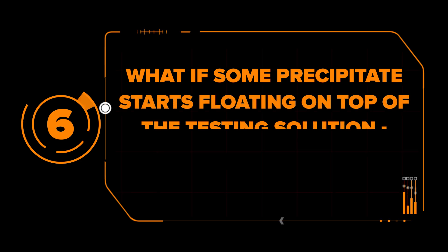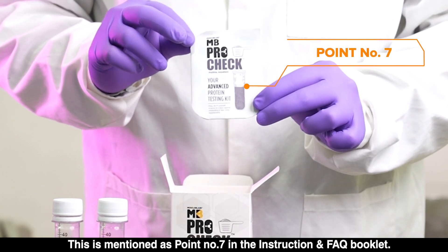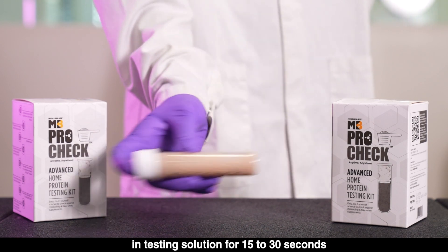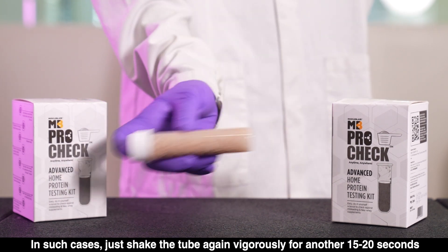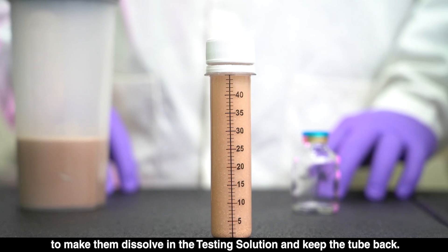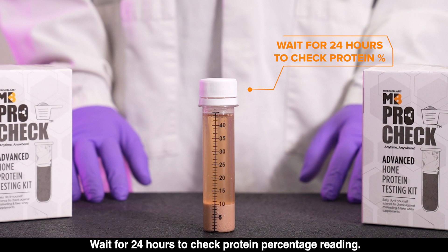Mistake 6: What if some precipitates start floating on top of the testing solution instead of completely settling down? This is addressed in point number 7 of the instruction and FAQ booklet. It may happen that even after vigorously shaking the shake in the testing solution for 15 to 30 seconds and keeping the tube for 1 hour, you still observe unsettled precipitates floating on top. In such cases, shake the tube again vigorously for another 15 to 20 seconds to make them dissolve in the testing solution and keep the tube back. If it is whey protein, it will fully react and give a precipitate that settles at the bottom. Wait 24 hours to check the protein percentage reading.